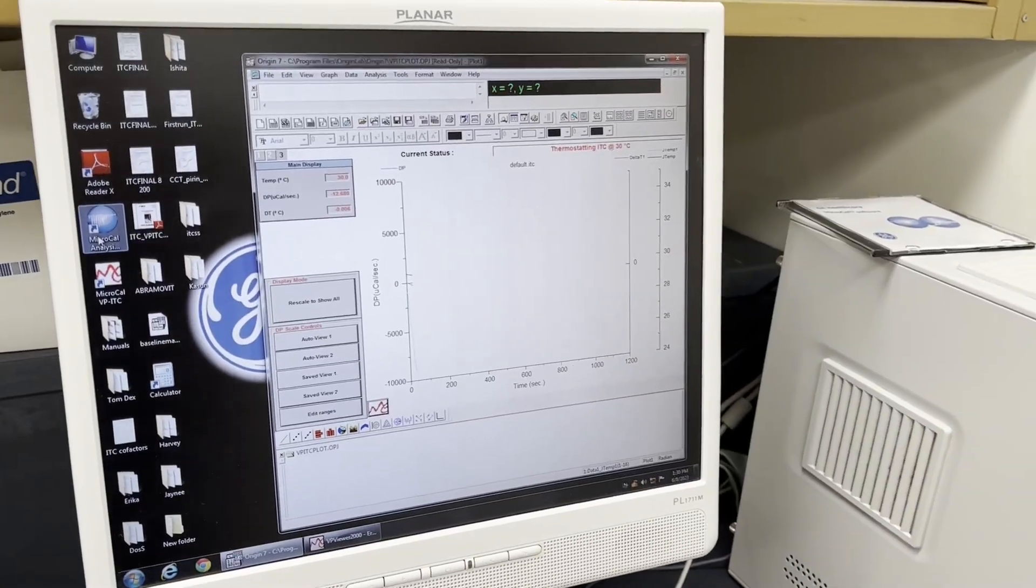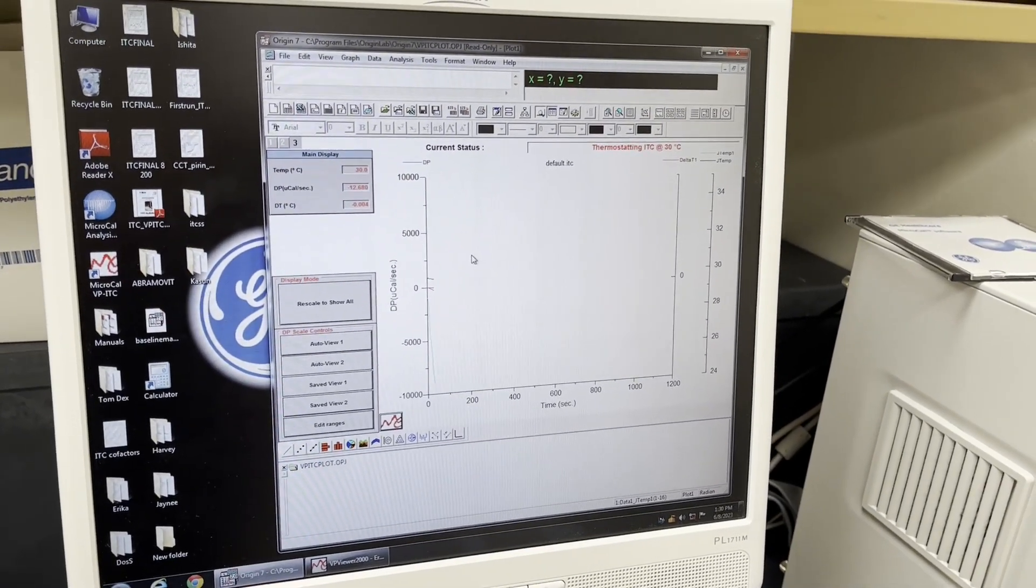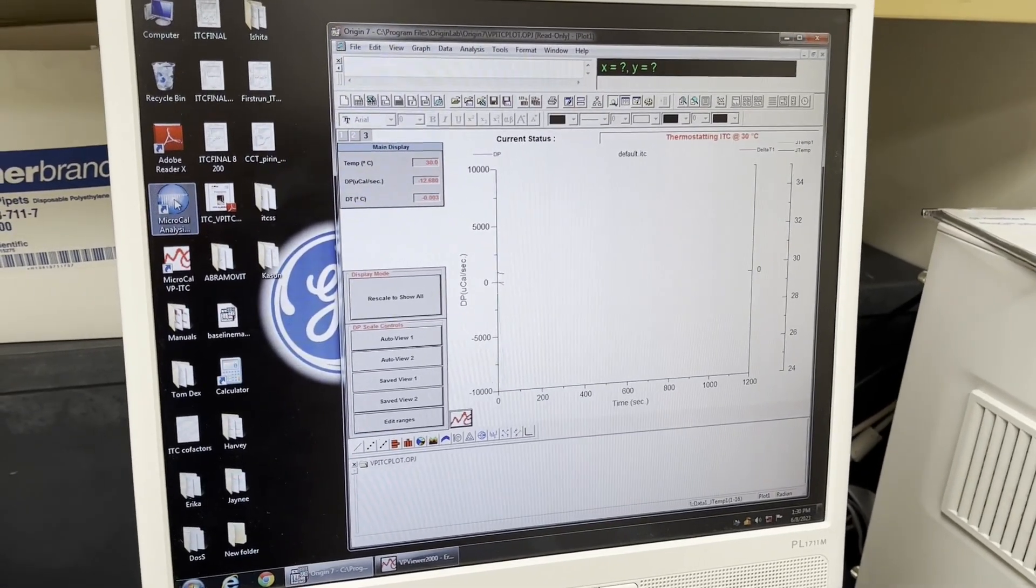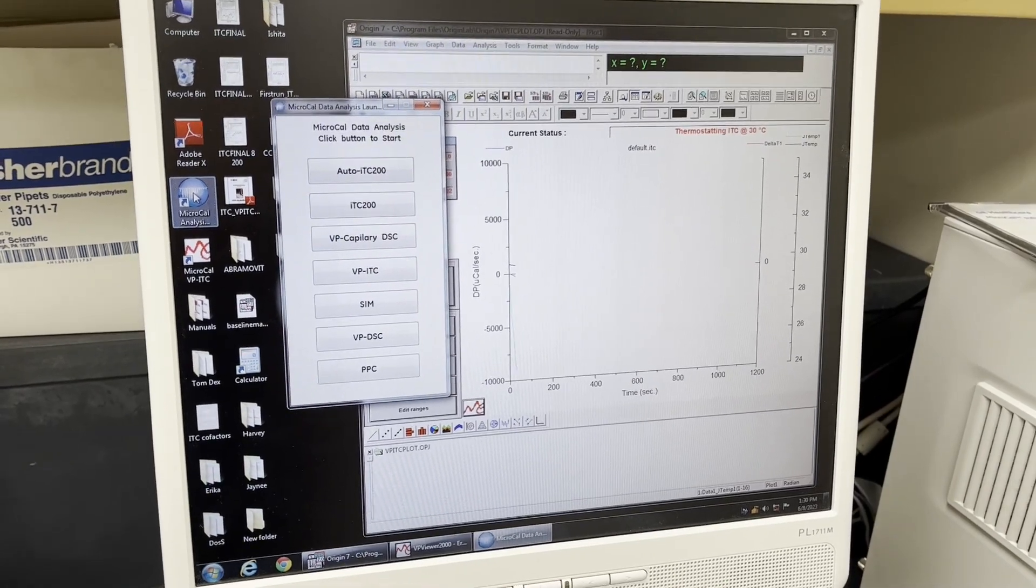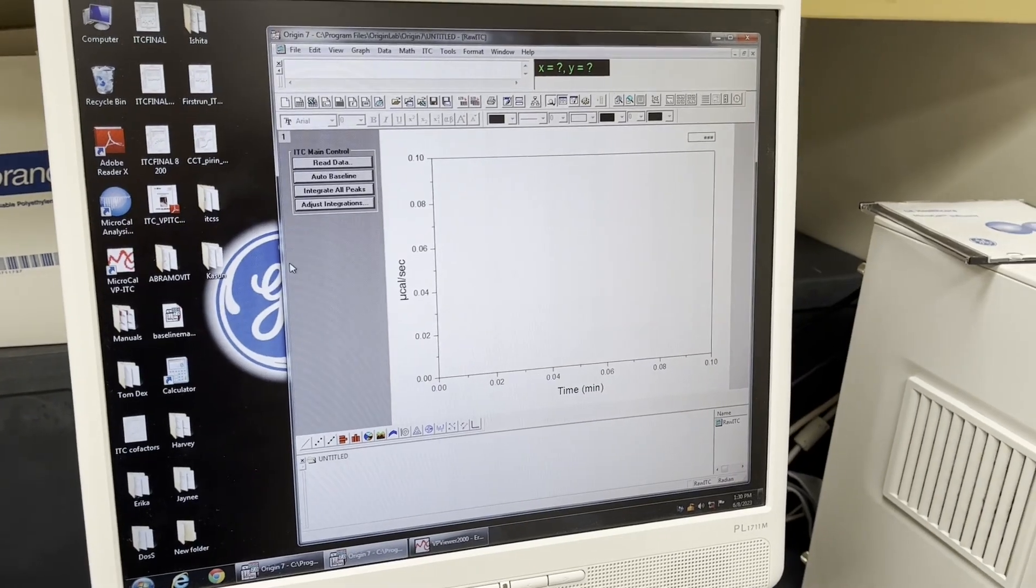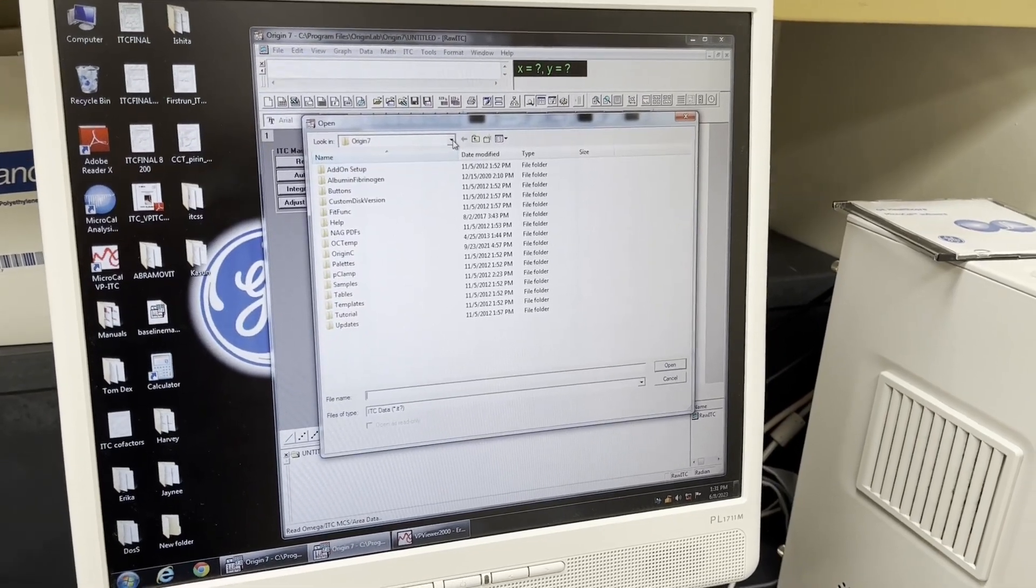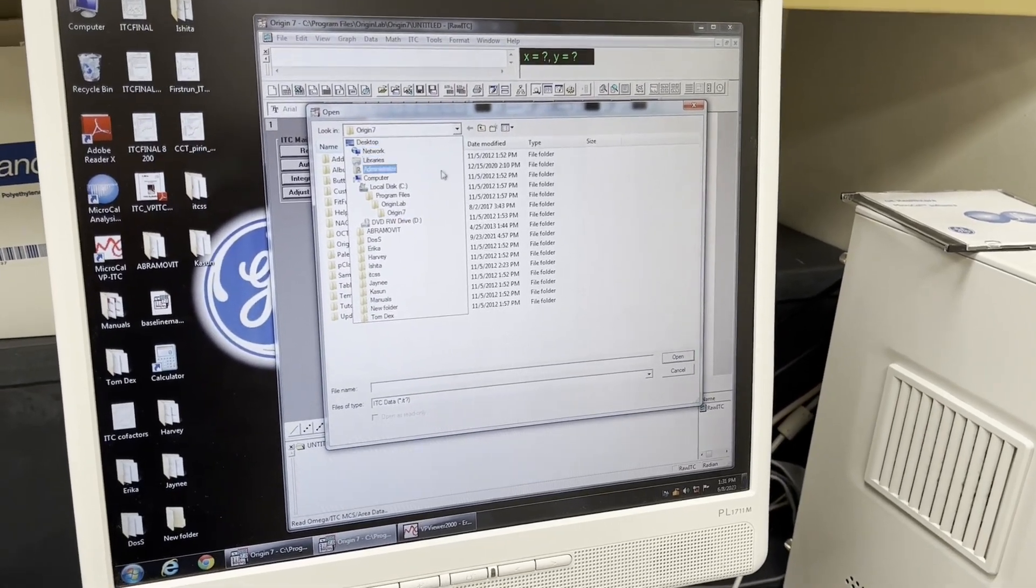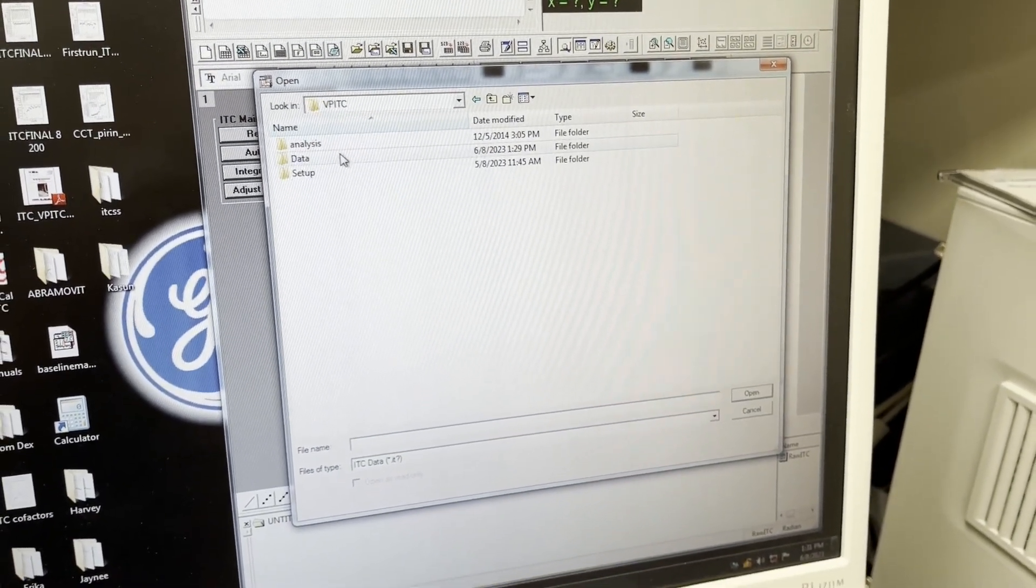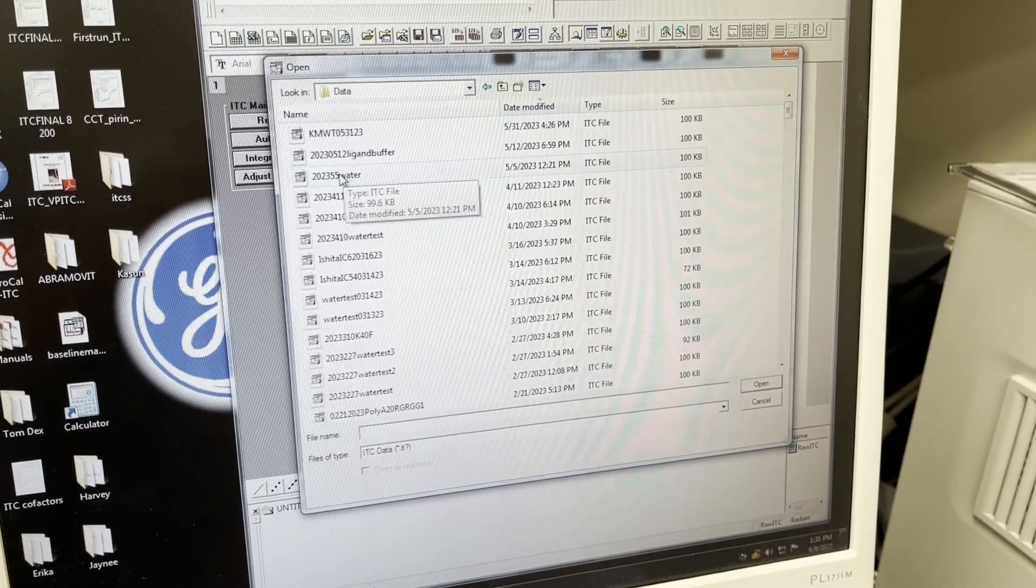Once your run is complete you will see the raw data. If you would like to analyze your data, what you want to go to is this piece of software here, the microcal analysis launcher. You want to pick the BPITC because that's the instrument that we're using. This is based on Origin software. What you want to do is click read data and it's a little cumbersome to find your data. You want to go to C, VPITC data, and I'll just show you a previous water run that I performed.